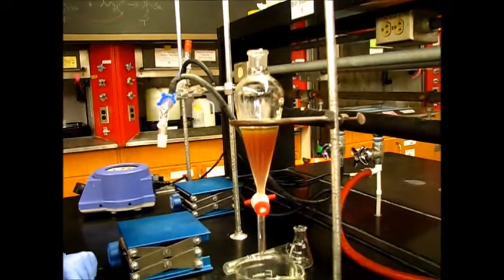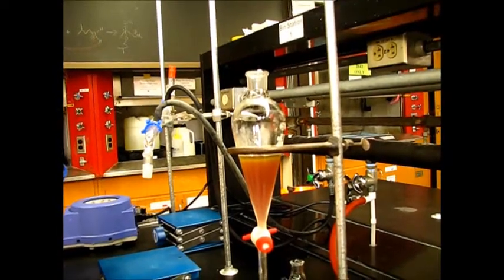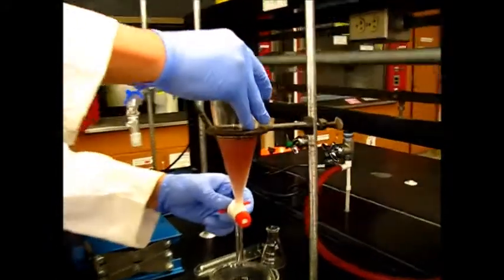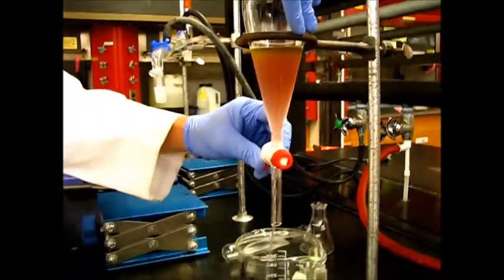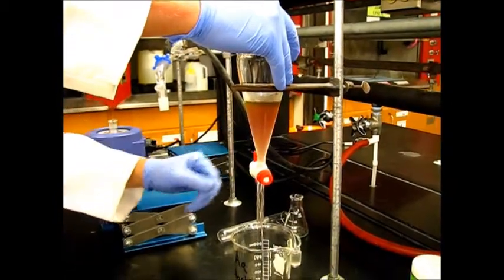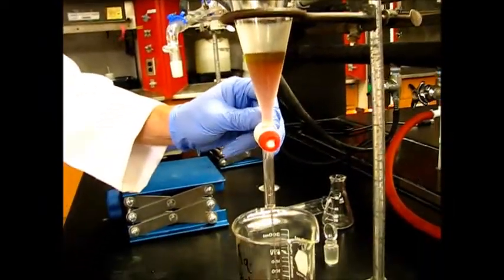We need to wait at least 5 minutes, let the two layers separate. So now that the layers have separated, we're going to drain off our lower aqueous layer. The bottom layer is waste and the top layer is our product.